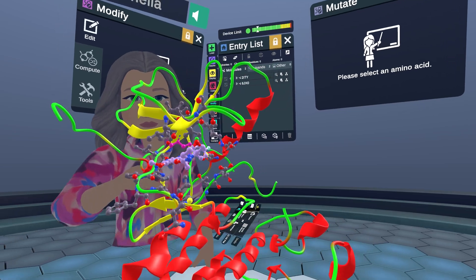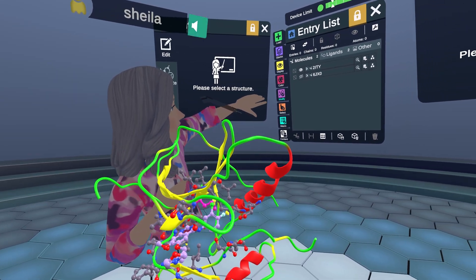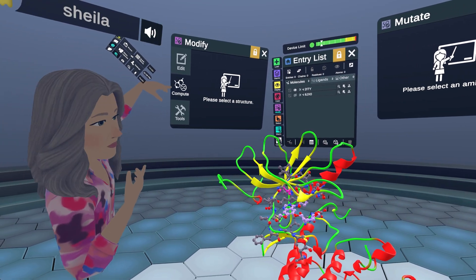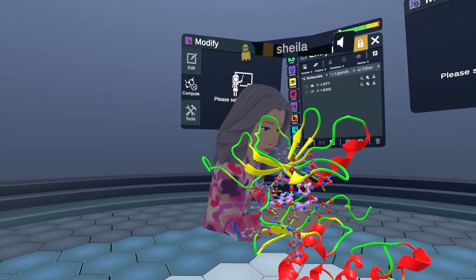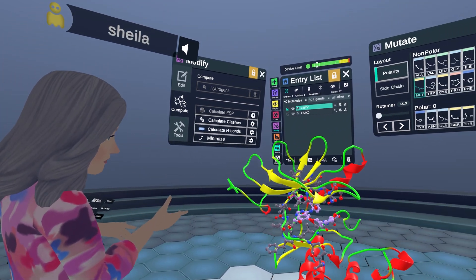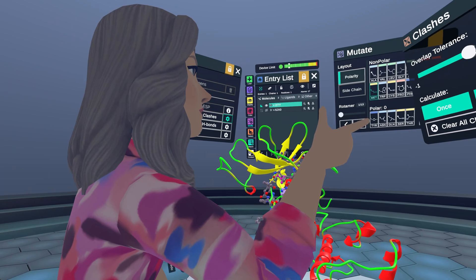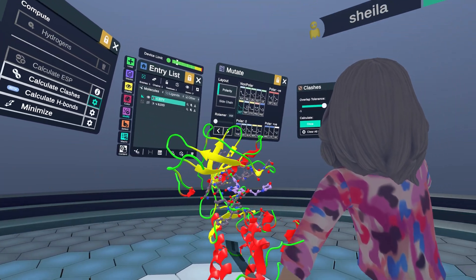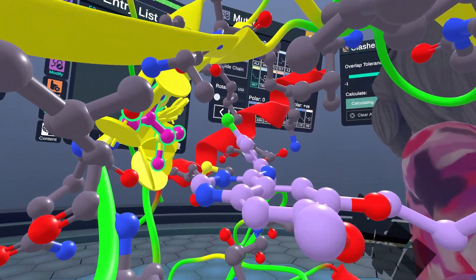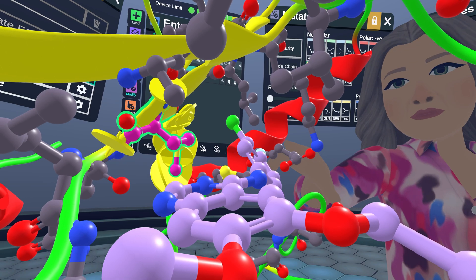To look at the different rotamers of the methionine, I can go to the Modify menu and compute clashes. I need to reselect that residue with the selector tool first. In the clashes menu, I can choose to continuously monitor the clashes so we can scroll through our rotamers and watch as the clashes change.